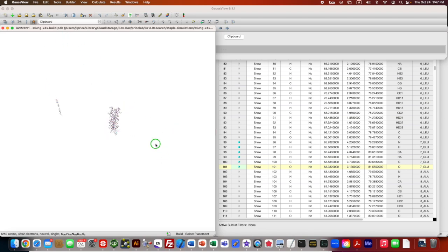That pastes the molecule into this file. Now you can sort of see what happened there. The molecule's clear over here, and that's kind of weird. And so we've got to get it into position. To do this, on my keyboard, I don't know how it is on the supercomputer, you press the Option key and the Shift key, and that allows you to click on the one molecule without moving the other.